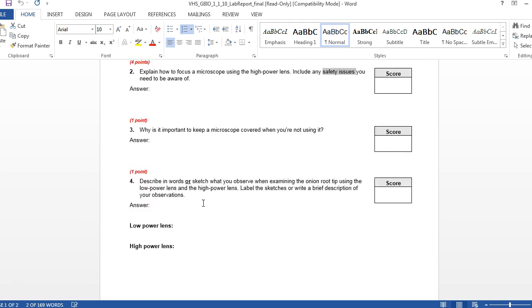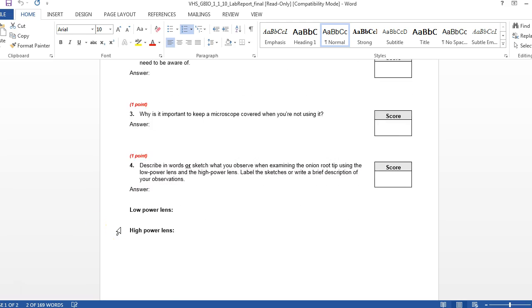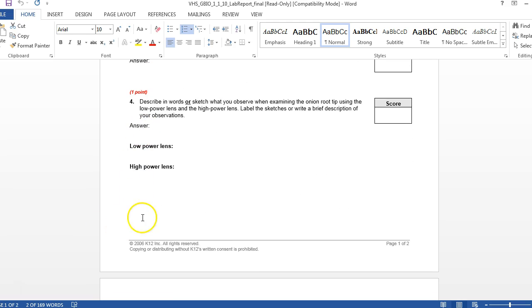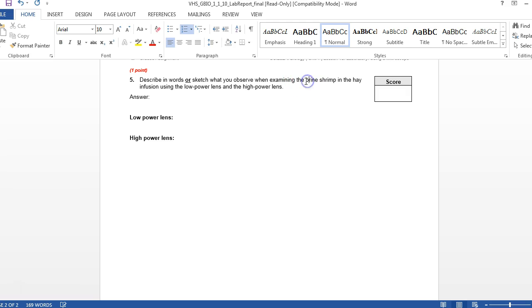All right, so those are the first 3 questions in the lab report. You should be able to answer those now. The next 2 questions are going to require us to actually go into the lab where we're going to be observing the onion root tip. And we're also going to be observing the brine shrimp in the hay infusion.